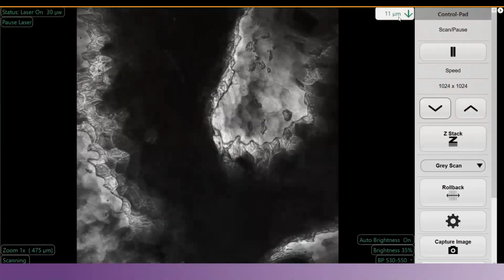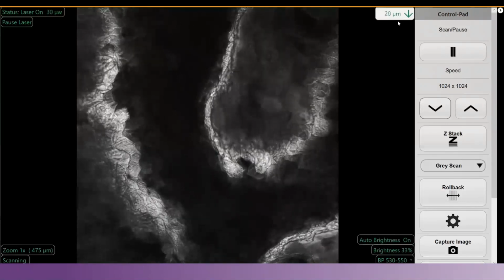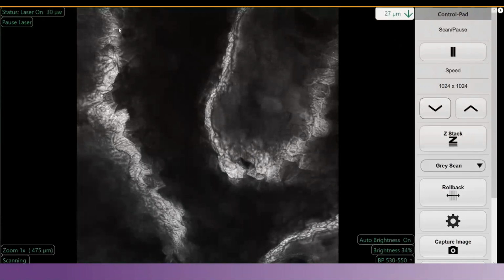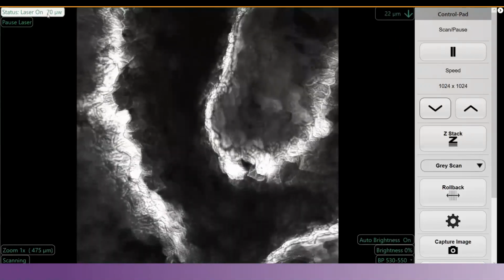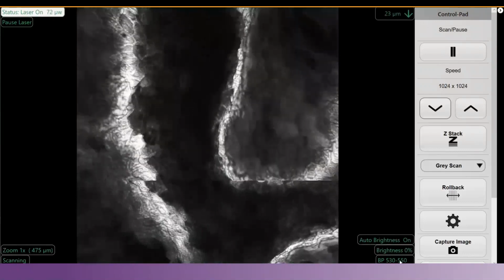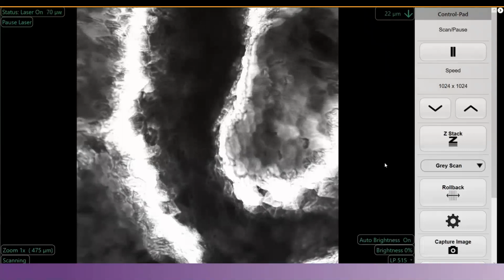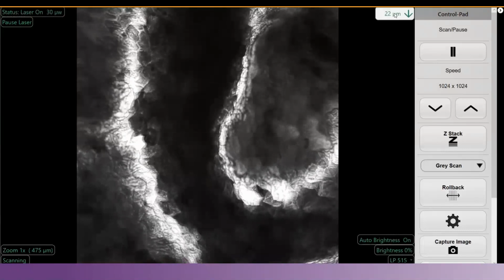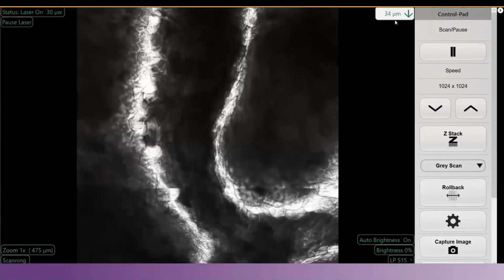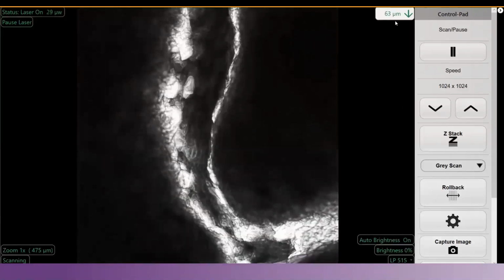Now I'm going deep into the tissue, like 20 microns, and you can see the ridges of my fingerprint and how the cells are organized on that. I'm increasing a bit of laser power, and I'm switching the filter. As you can see, the image is oversaturated even at 70 microwatt. So I'm reducing the laser power, and then I'll try and go deeper into the tissue just to see where that fingerprint ridge is originating.